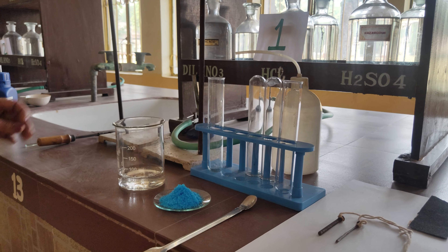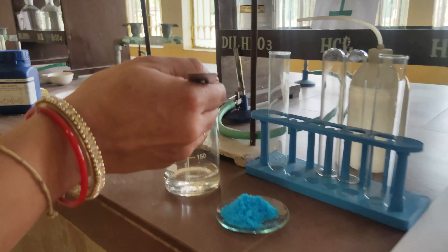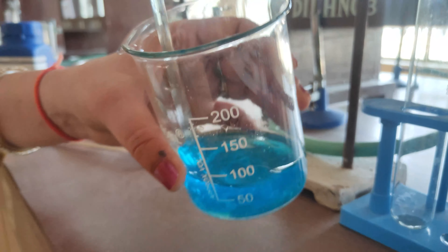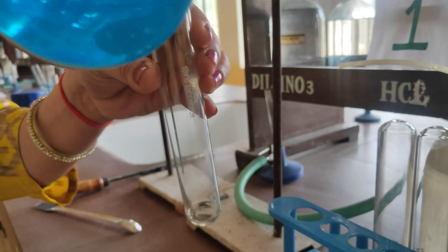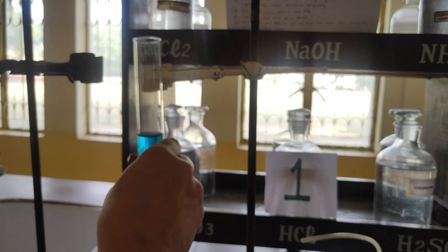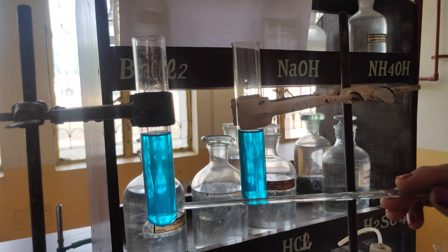Procedure: Take sufficient quantity of distilled water in a clean beaker. To this, add a required quantity of copper sulphate. Stir the contents using a glass rod until the copper sulphate crystals dissolve completely. Pour some copper sulphate solution into a test tube and clamp it to a stand. Then pour some into another test tube and clamp it to the other stand.